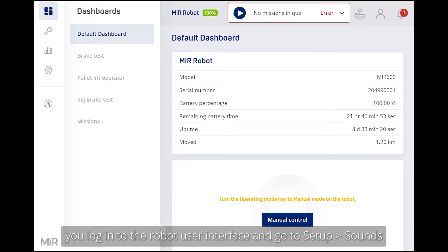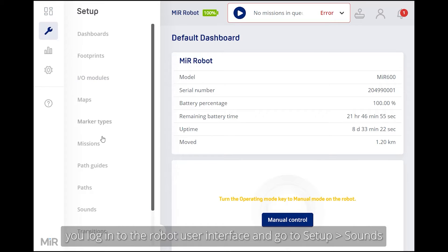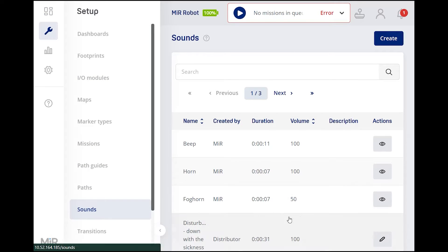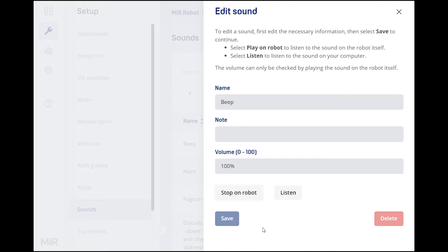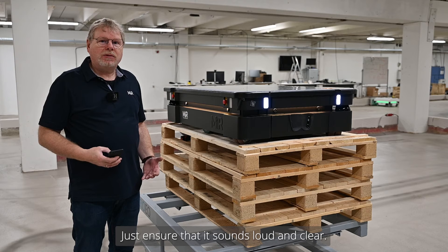To inspect the speaker, log on to the robot user interface. Go to Setup, then Sound, pick a sound, and make it play on the robot. Just ensure that it sounds loud and clear.